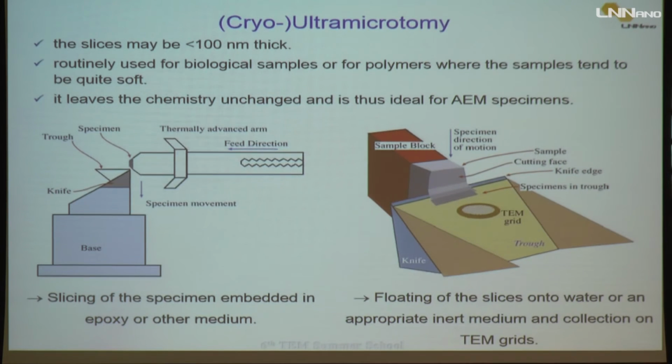And then it's important to put the sample at cryo temperature to make it hard to be able to cut the material.